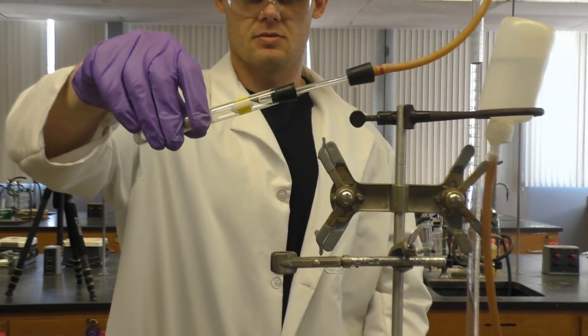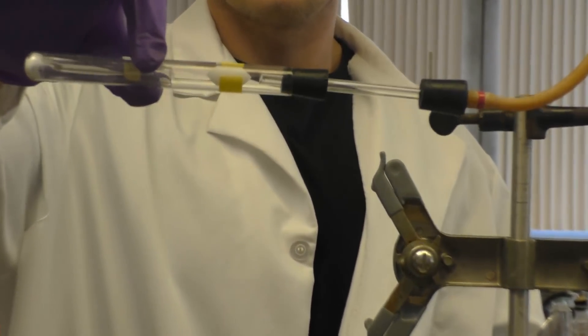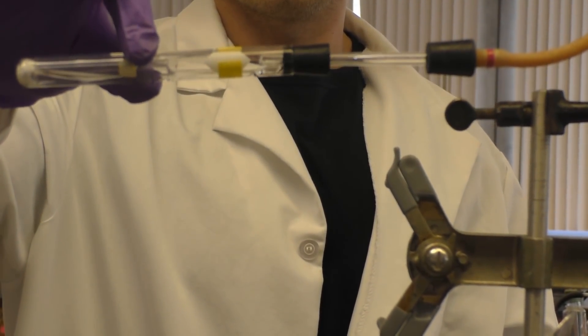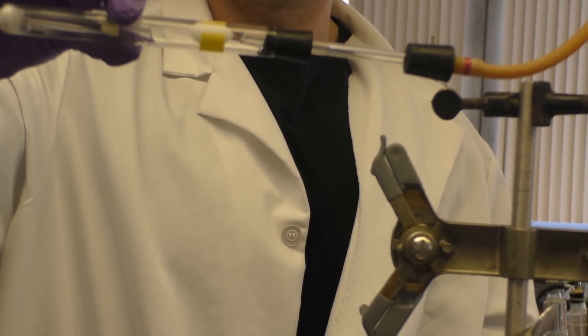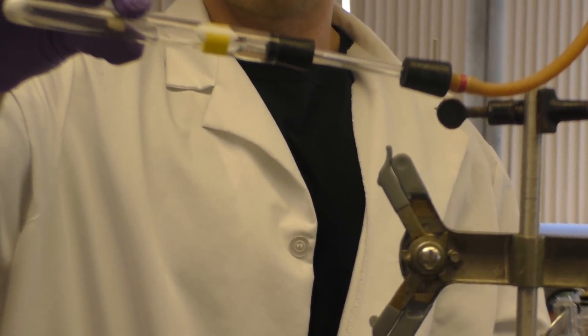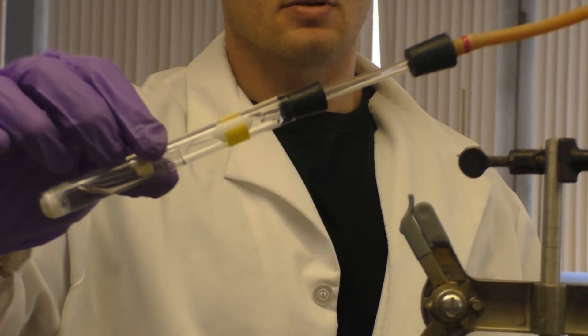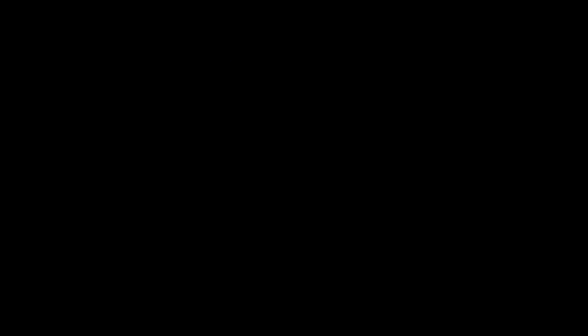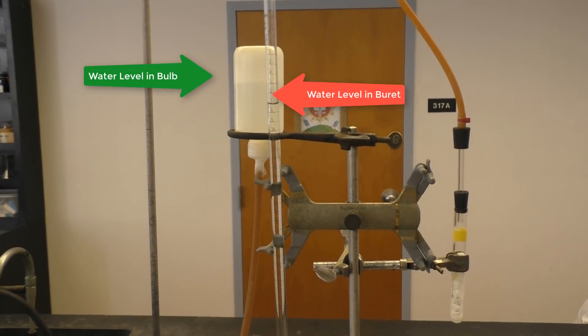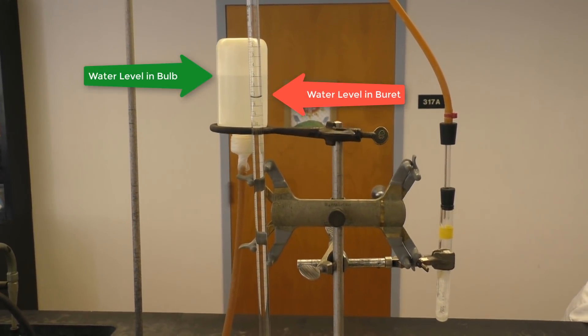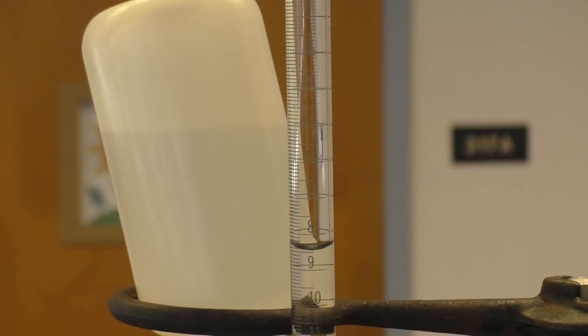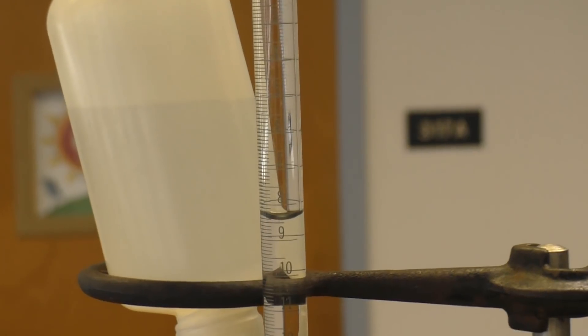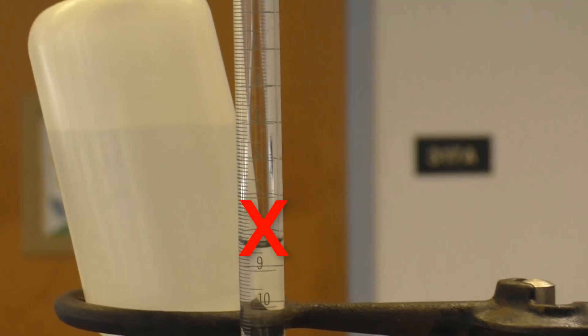React the Alka-Seltzer with hydrochloric acid by loosening your clamp holding your reaction chamber and then tilting the test tube so that the hydrochloric acid pours onto the Alka-Seltzer powder. Then re-tighten your clamp and watch. Notice how as the reaction proceeds, the water level in the burette changes. This is due to the production of CO2 gas which pushes the water in the burette. Your reaction is done when the water level in your burette stops changing. Do not write down this volume.